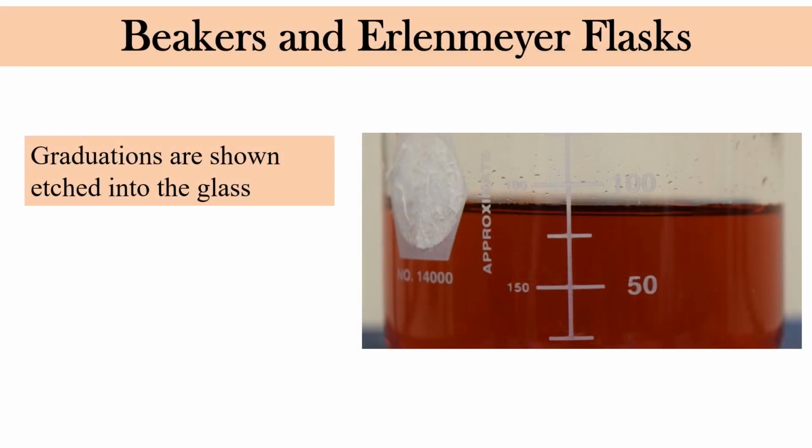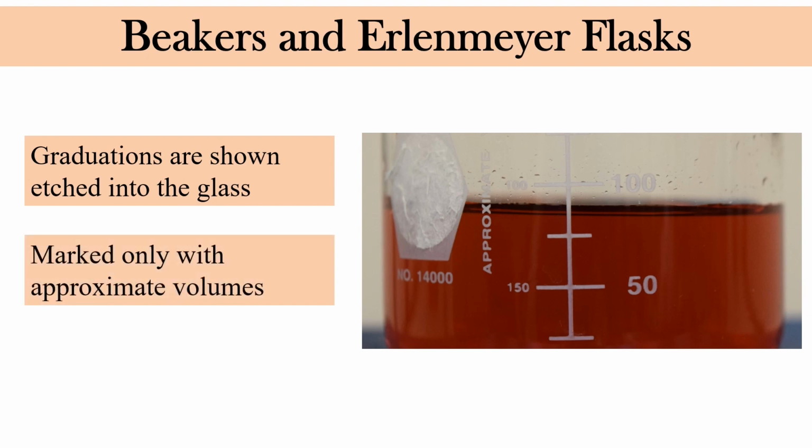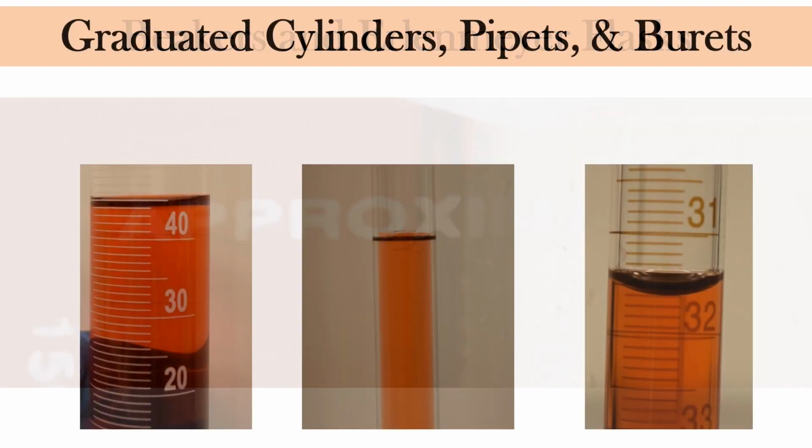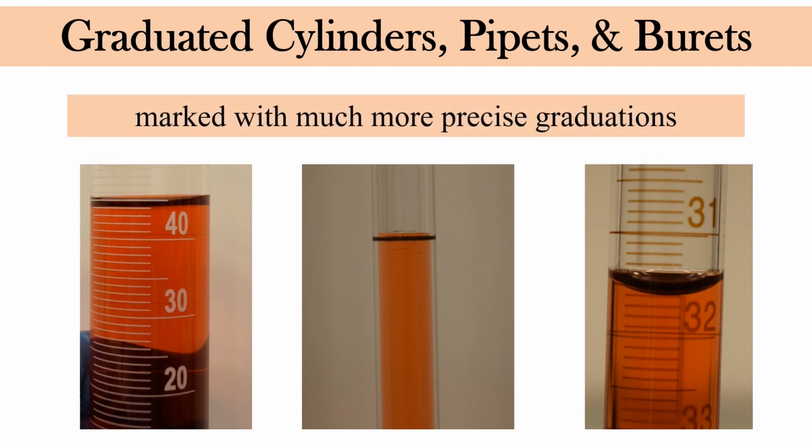Graduations are shown etched into the glass, usually in white. Beakers and Erlenmeyer flasks, for example, are marked only with approximate volumes. In the image shown here, the beaker is labeled with the term approximate on the glass itself. Other glassware, such as the graduated cylinder, pipettes, and burets, are marked with much more precise graduations.